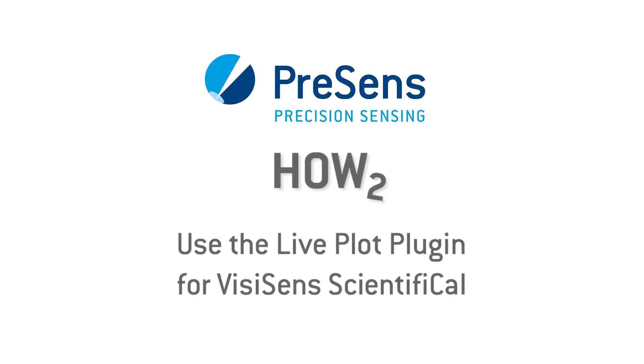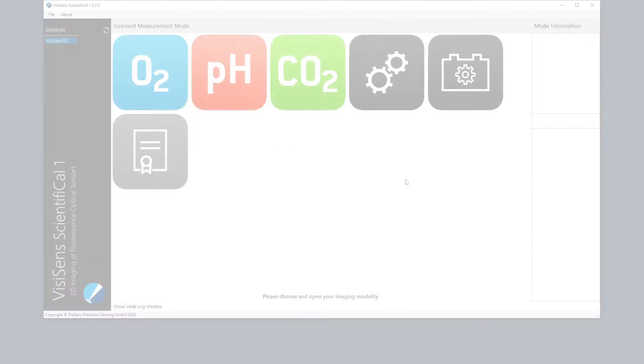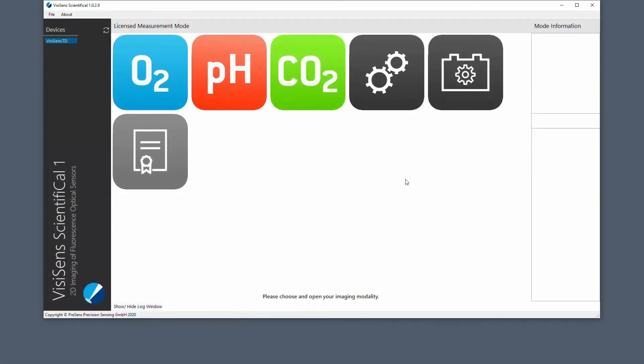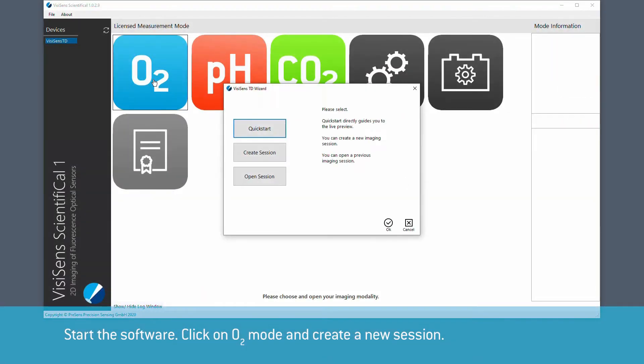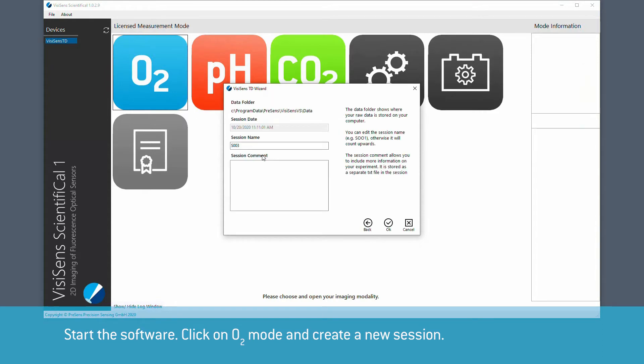In this video, we will show you how to use the Live Plot plugin for VisiSens ScientifiCal software. Start the software, click on O2 mode and create a new session.